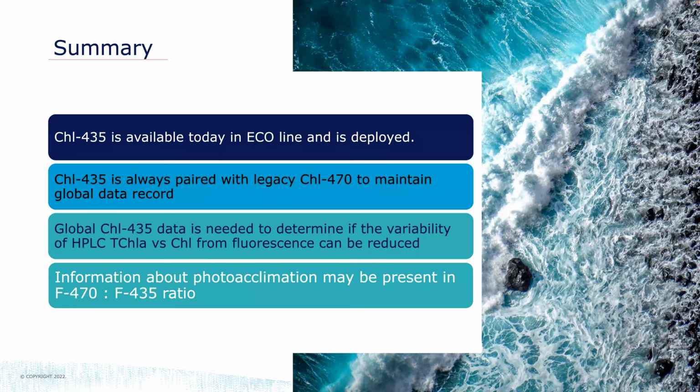I hope you've all found this useful. Again, it's quite a tour to go from carbon cycle to a fluorometric equation to a Jablonski energy diagram to, essentially, when it comes down to it, changing the color, and we put a little filter over it just to make sure if there's any variability in the LED, and it gives us a sharper cutoff right near that change in the chlorophyll A absorption. But we are essentially changing an LED and a filter, and frankly, that's all we've done to create that new channel.